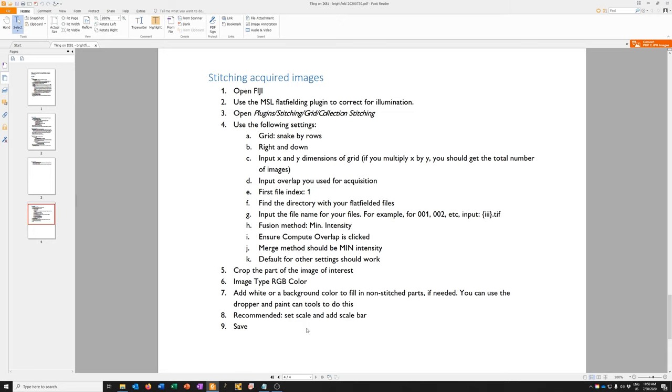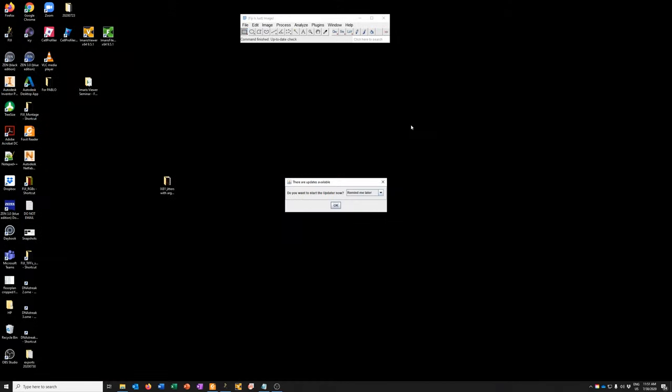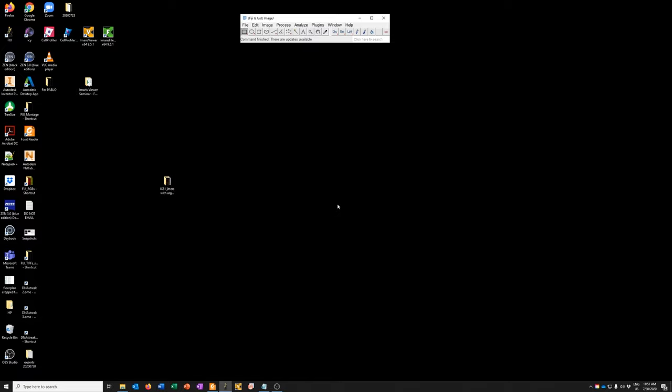So the first step is to open Fiji. Let's go ahead and do that. Fiji has just been opened. It's asking me whether I want to start the update or ignore this. Let's look at the next step.